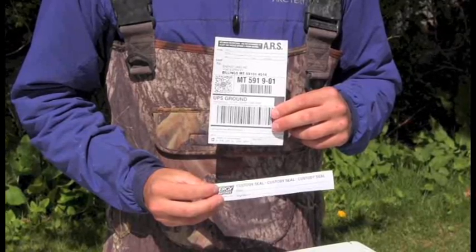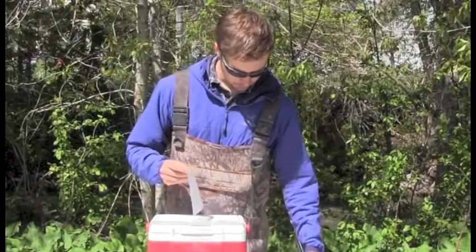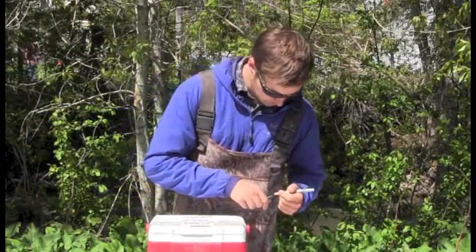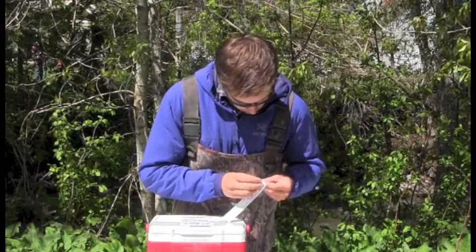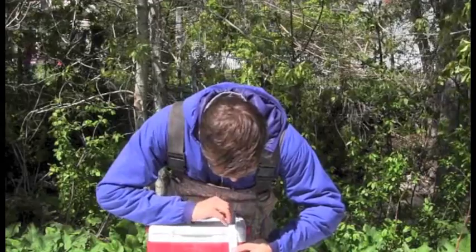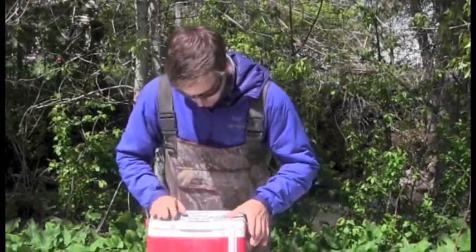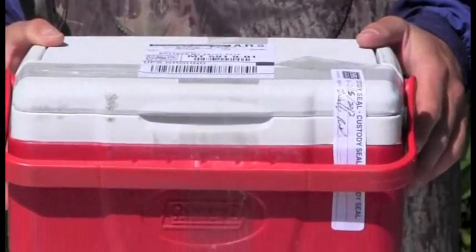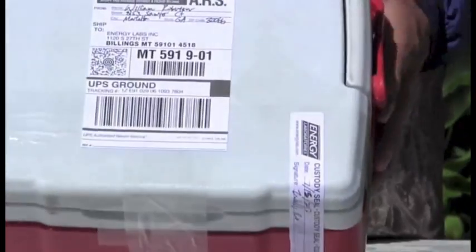Along with your samples, the lab should have provided you with a shipping label and a custody seal. Fill in the return address on the shipping label and sign the custody seal. Place the shipping label on top of the cooler, and the custody seal should be placed vertically over the top of the cooler. This custody seal ensures that the cooler has not been opened or tampered with during transport to the lab. You are now ready to ship your samples. Remember to ship samples on a Monday or Tuesday so that they have enough time to get to the lab for processing before the weekend.